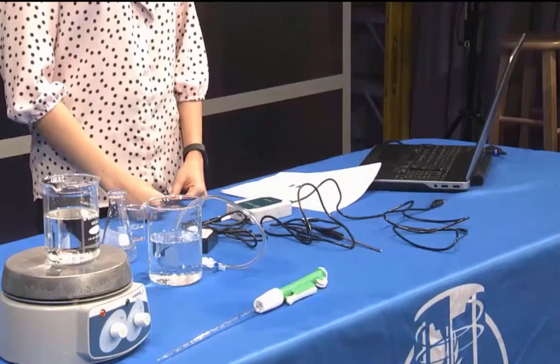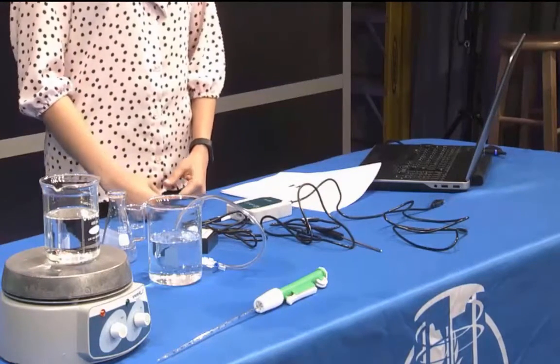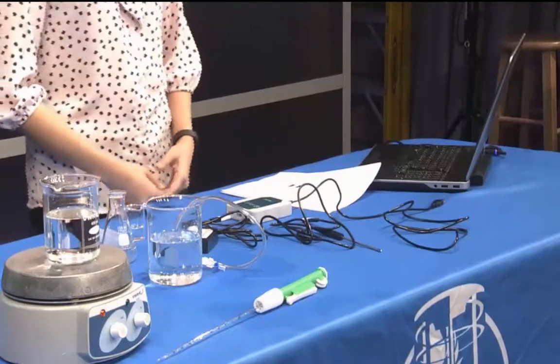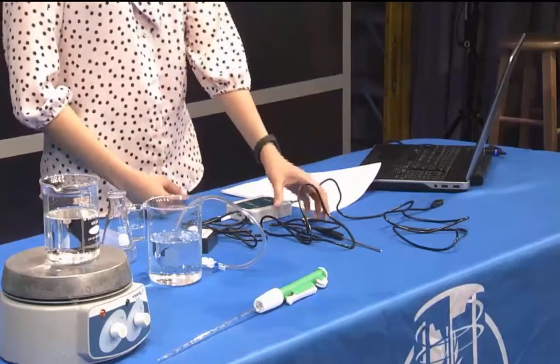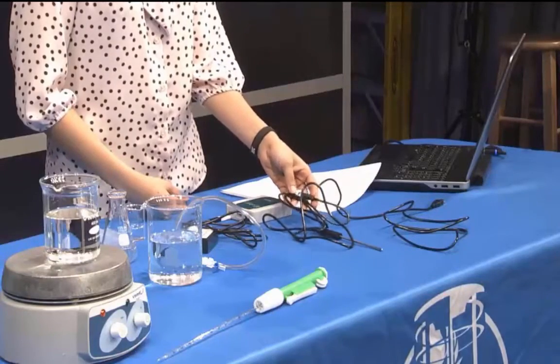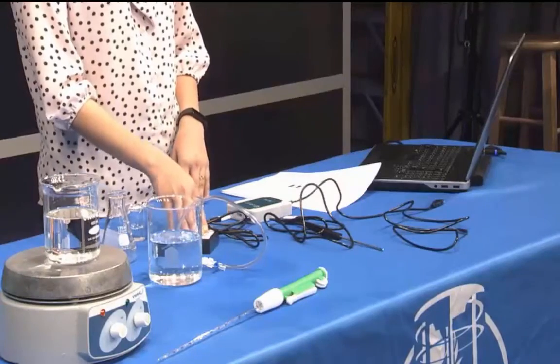Next, let's talk about the Vernier equipment you're given for this experiment. You are given a temperature probe which will measure the temperature changes as you add hot water to the beaker. You'll also be given a pressure probe which is attached to a stopper.